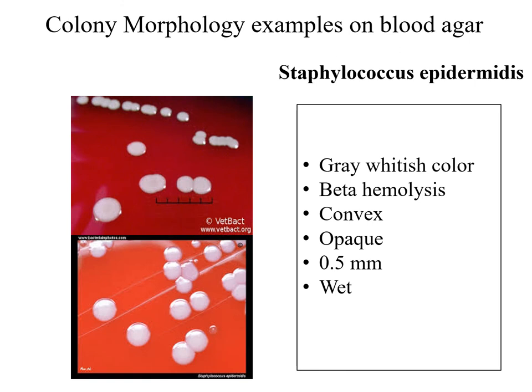Staphylococcus epidermidis has a grayish-whitish color. The colonies are smaller than Staph aureus, and are characterized by being beta-hemolytic as well. The colonies are convex, opaque, and wet.